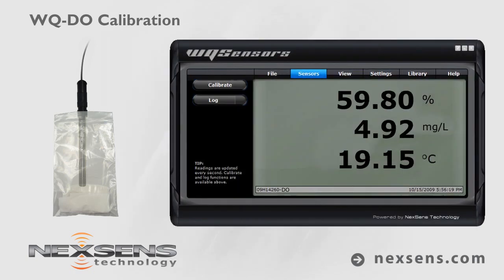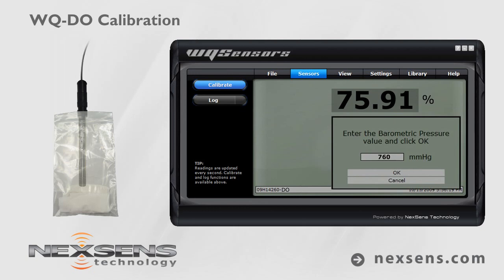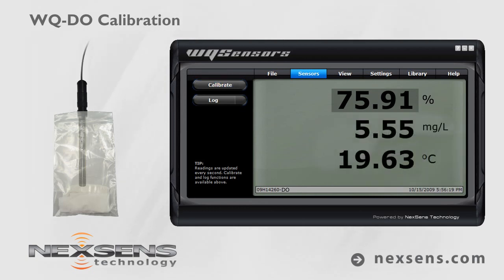Allow the reading to stabilize. If the probe was recently plugged in, it may take several minutes to polarize. Press the Calibrate button and then select DO percent saturation. Adjust the barometric pressure value to the local barometer and press OK.